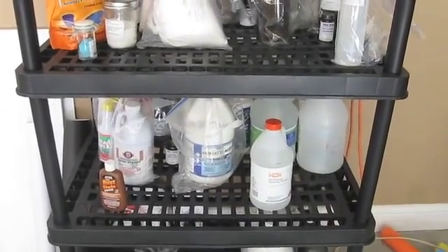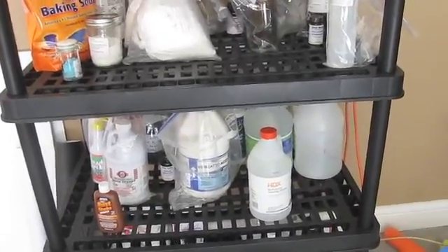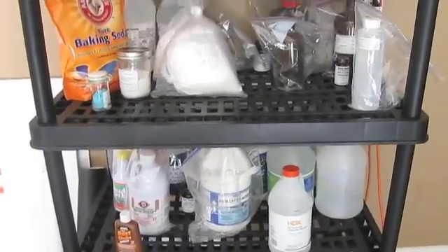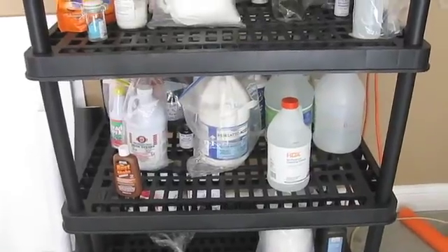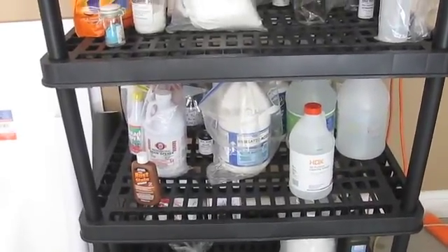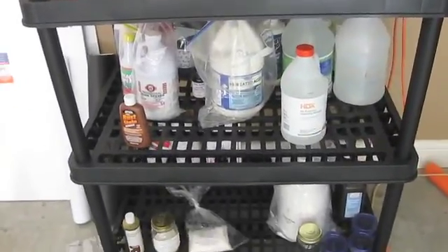I just want to talk about some key incompatibilities — chemicals that you shouldn't store close together, and preferably on different shelves, which is why I got this other shelf. Chemicals to store on different shelves would be: acids and bases, acids and metals, oxidizers and reducers, and oxidizers and flammables.